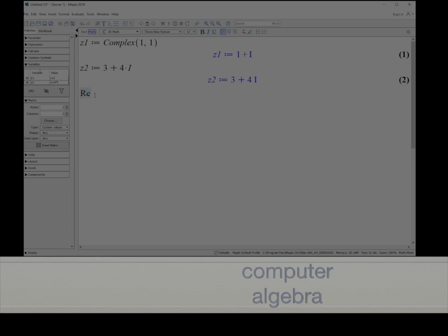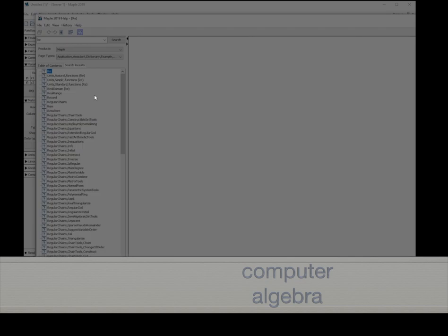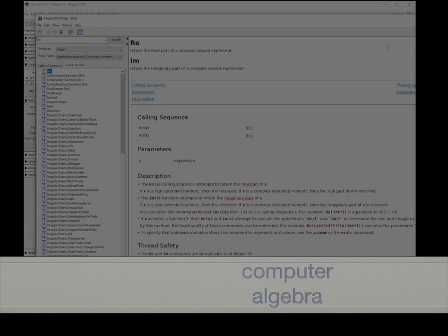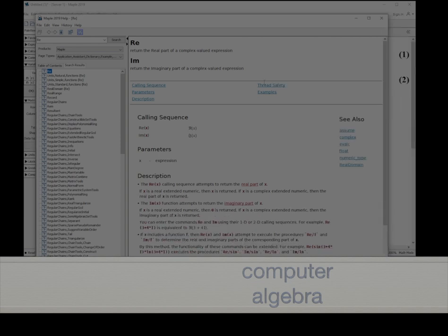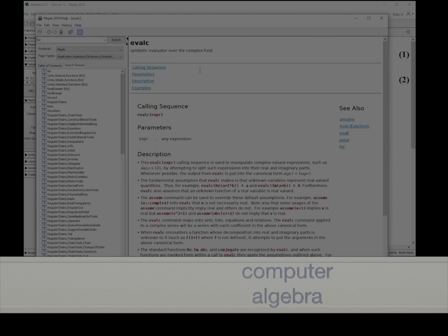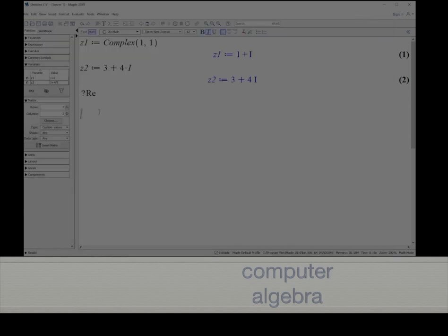We might guess that there is a function, for example, with the name RE. We do not know, so we will ask the Maple system whether there is such a thing. Indeed, the Maple help system opens. Then you can get a lot of information about the function real or imaginary, or you can also get information about the evaluation over the complex field.